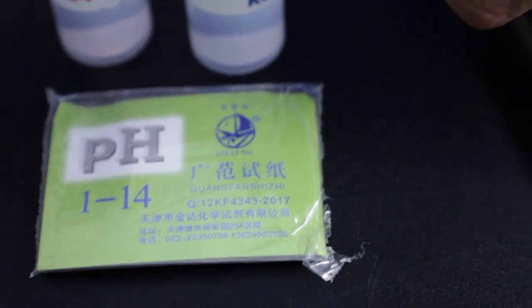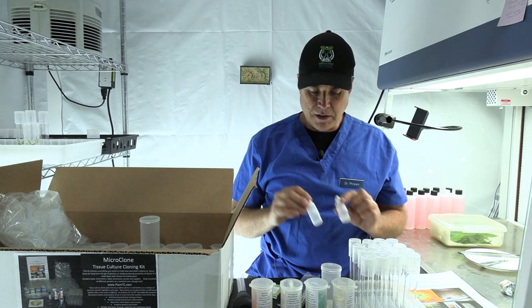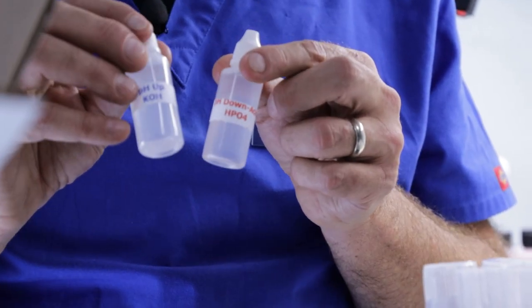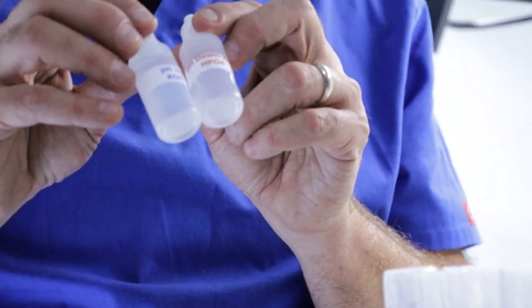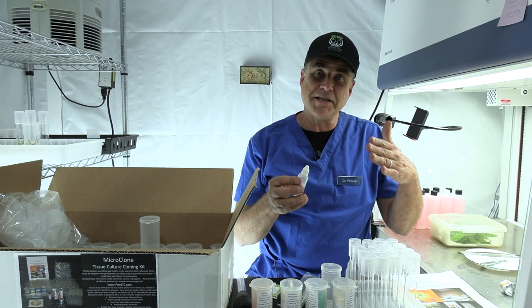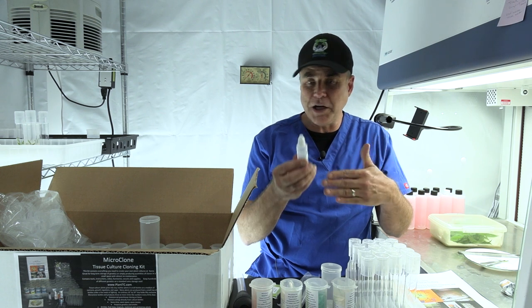When you're mixing everything up, I've given you easy-to-use little bottles of pH up and down. For those without a pH meter yet, I include some pH papers. These are exactly the same nutrient pH corrections as you'd buy at the hydro store — just like General Hydro or Grow More brands, just diluted to about half or a third of their regular strength. We dilute it so that one drop will move the media about a tenth of a point on the pH scale, making it easy to count out on a digital pH meter. If yours is a little strong or weak, you can always add water to it.